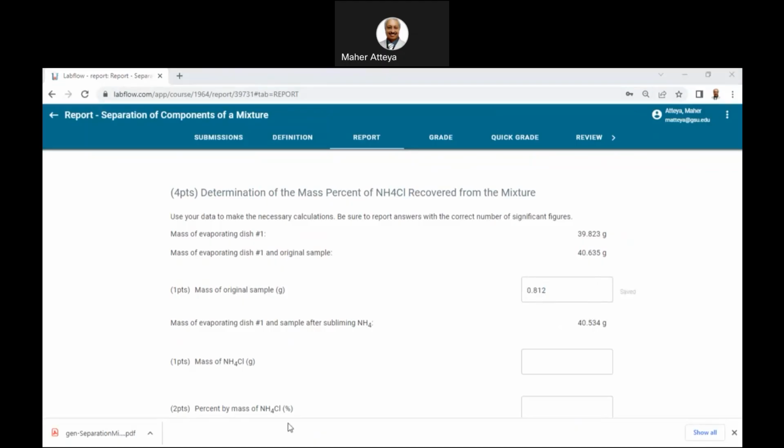So I'll take this one here. I will say 40.635 minus 40.534.